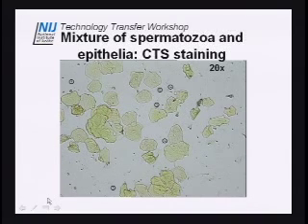And as you can see here, what I did was I circled some of the spermatozoa here. They're very small in this image. But this is what most of you typically see when you're doing a differential and you do your Christmas tree staining. And the red isn't showing up very well on here, but you get the gist of it. The nuclear material is stained red.